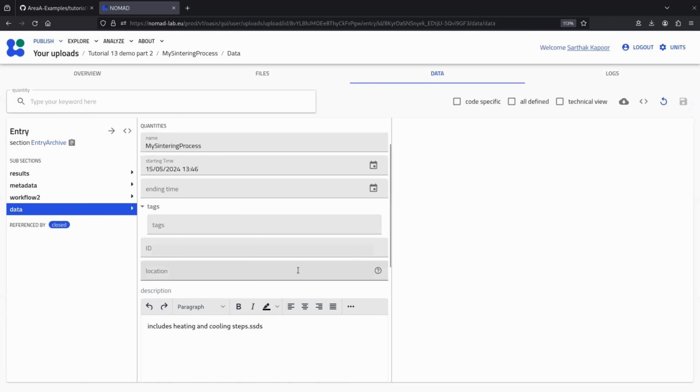Thank you. Yeah. And also one further question. So when you created this additional step, did you click somewhere on add and then this JSON file was created? I did not see where you clicked.